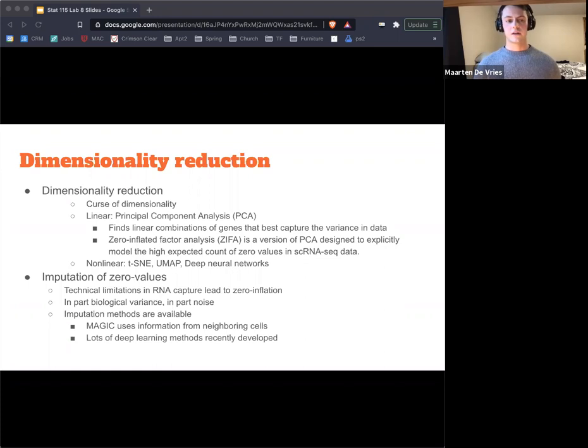And there's some debate going on here because, as you might expect, single-cell RNA-seq data has a lot of zeros. It's mostly zeros, any single-cell RNA-seq expression matrix. This is partly due to the fact that some genes just aren't expressed in certain cells, right? And it's also partly that in our reaction, we just don't capture a high percentage of all those transcripts. It might only be 10%, with a wide confidence interval, maybe between 10 and 50% of those transcripts that you capture. So you're just missing a lot there.